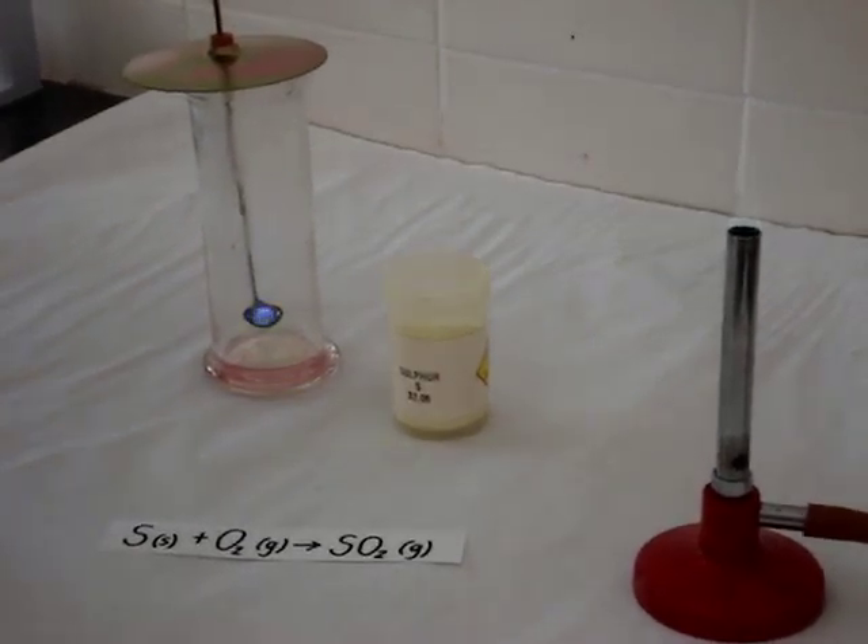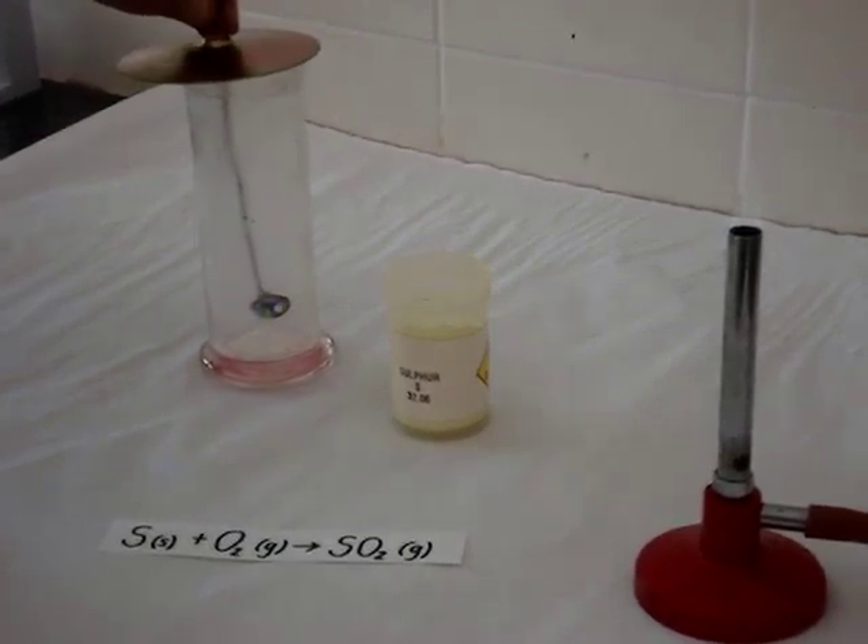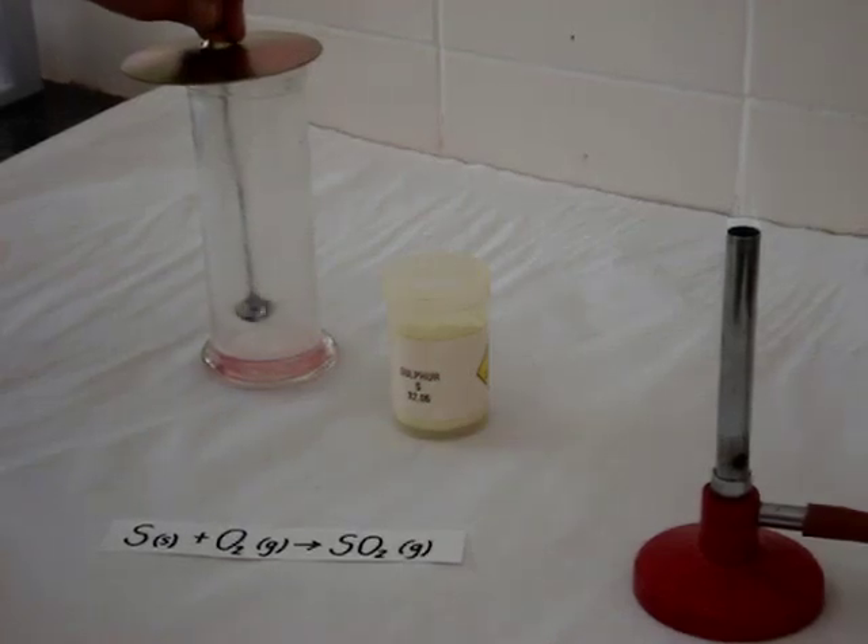And we can see a blue flame. Sulfur burns in oxygen with a blue flame to produce a choking gas called sulfur dioxide.